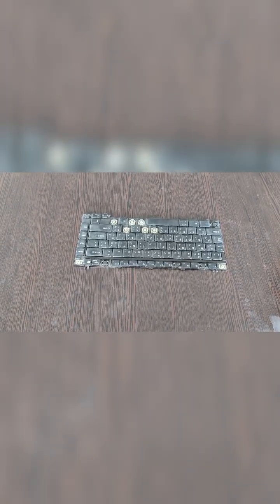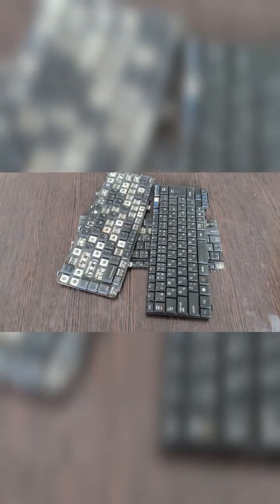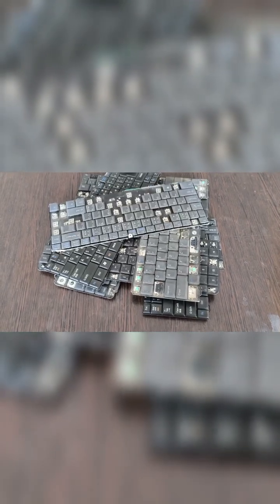In this video, we're going to recover silver from defective keyboards by recycling the polyester film inside them. Safety precautions are essential. Be sure to wear acid-resistant gloves and a respirator mask. Perform this work outdoors or under a chemical fume hood.